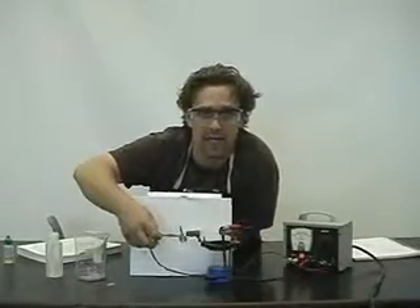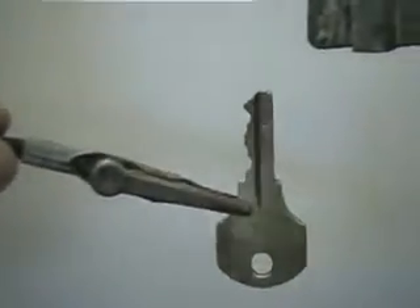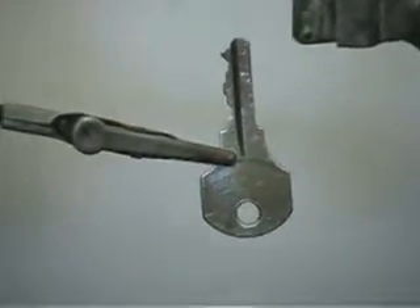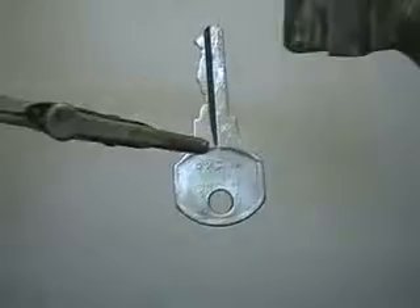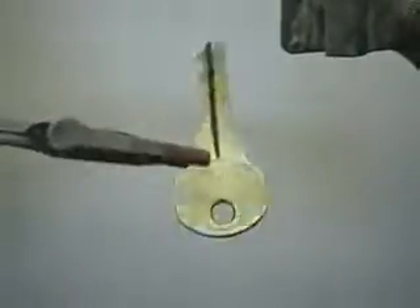We're going to take a look at our key right now, just before we plate it. You'll notice it's kind of a goldish color. What I've done is I've taken some steel wool and brushed it — it removes a little bit of the grime and the grease, the fingerprints. So we're going to place it into the solution now.